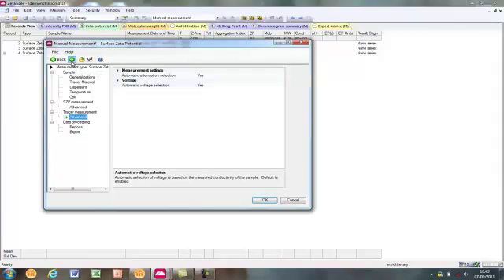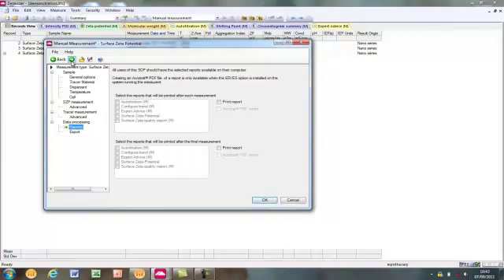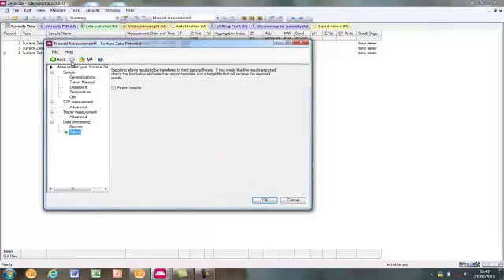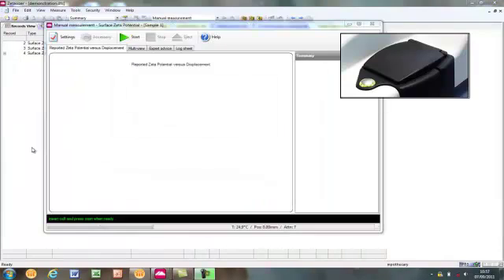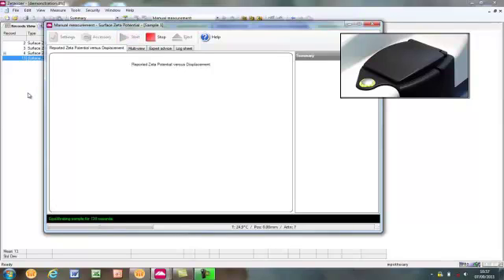Data processing, reports and export options are the same as for particle zeta potential measurements. The SOP is saved or in a manual measurement as here, clicking OK moves forward to performing the measurement. When the live measurement window opens, the measurement can be started. As with other zetasizer measurements and defined in the SOP, the optimisation begins with an equilibration period of, in this case, 120 seconds.